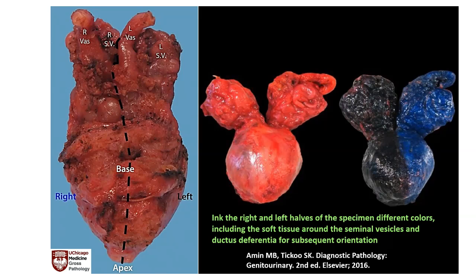Some prostatic specimen grossing protocols actually call for 4 colors, wherein you use yellow as well as green to mark out the right and the left lateral aspects of the prostate. That is not routinely followed across multiple institutes, simply because it adds more complexity to an already complex grossing procedure. But inking the specimen is mandatory because you need that orientation when you see the slides microscopically.